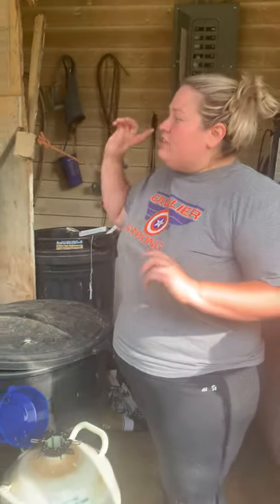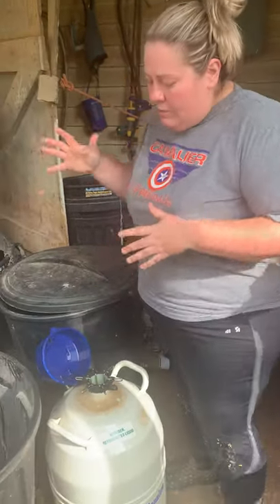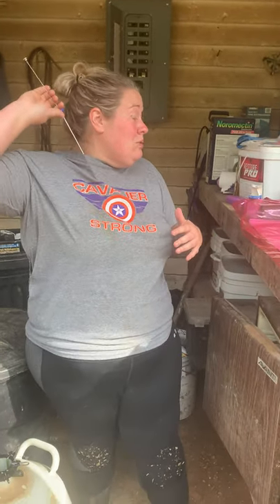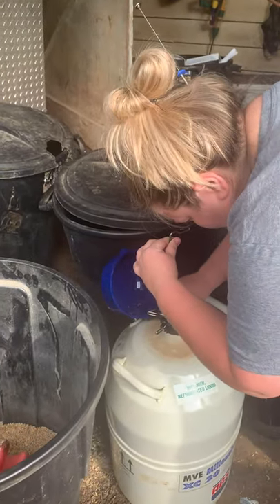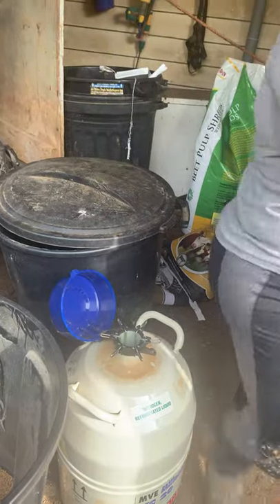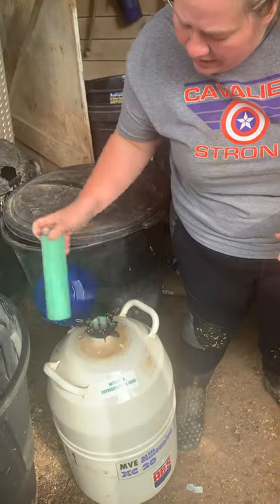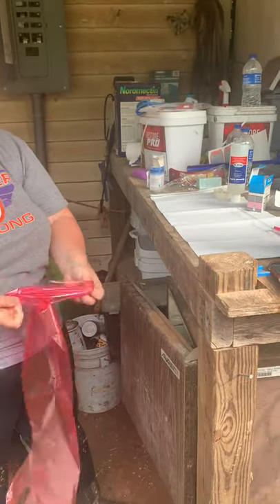Hey y'all, we are about ready to set up for artificial insemination. You might hear a tractor in the background. I've got my semen tank ready to go, all of the products I'm going to need, and my rod ready to AI. The first step is I'm going to get out my semen, get the straw semen, and put it in what is called the thaw unit. It stays in there for 45 seconds, so I've got my alarm set. While that is thawing out, I'm going to go ahead and get my glove and everything ready for the process of artificial insemination.